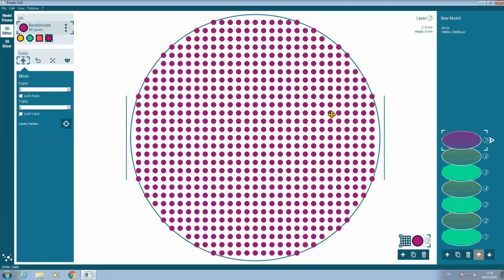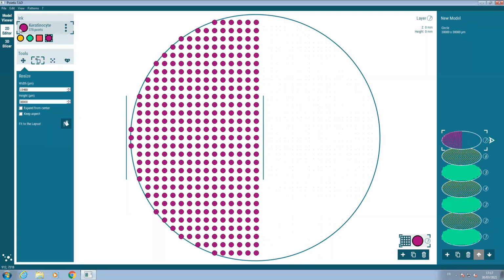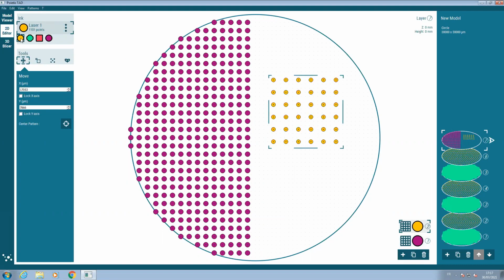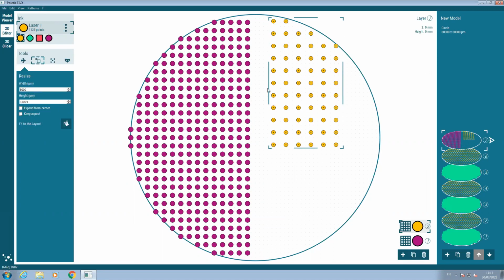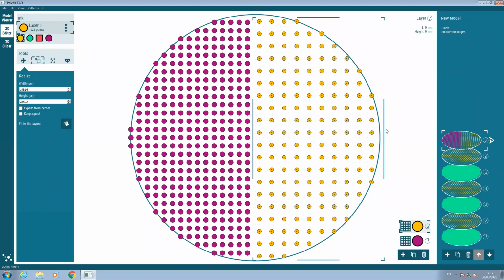So what you can do also, if you want to use different cell type, is to print a new pattern. So it was a recent publication of L'Oréal where they want to use different kind of keratinocyte, and you see it's really easy to do that. You can add another population here with a new pattern. So let's say this is a new kind of keratinocytes. And then you can resize and place your cells easily here, and it fits with your well. And so it's really easy. You can add as many cell types as you want.